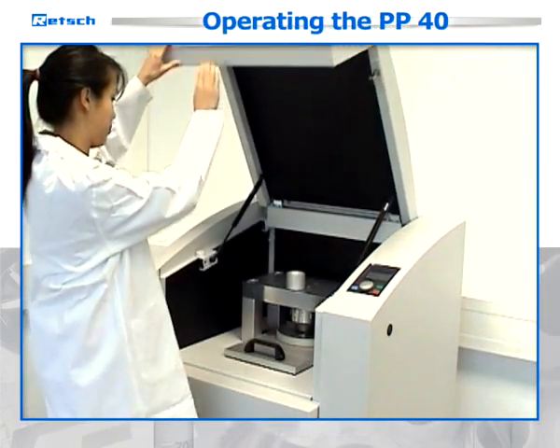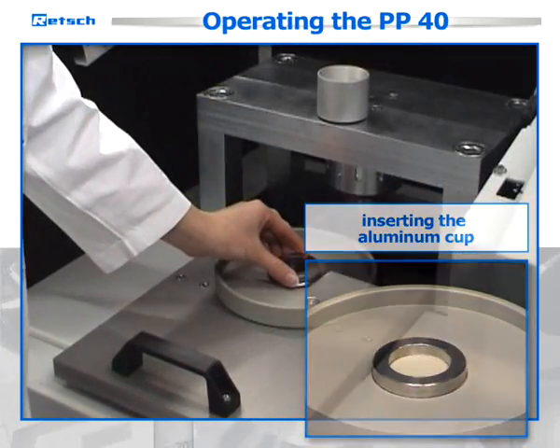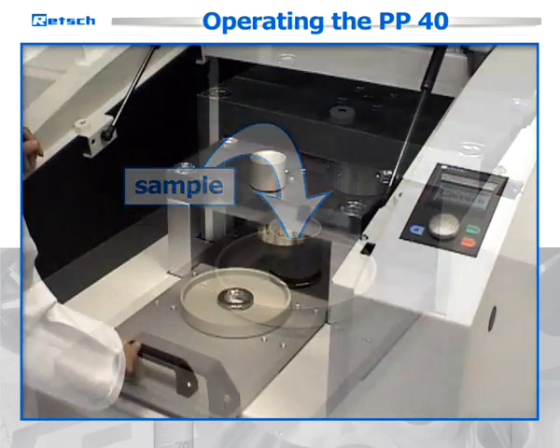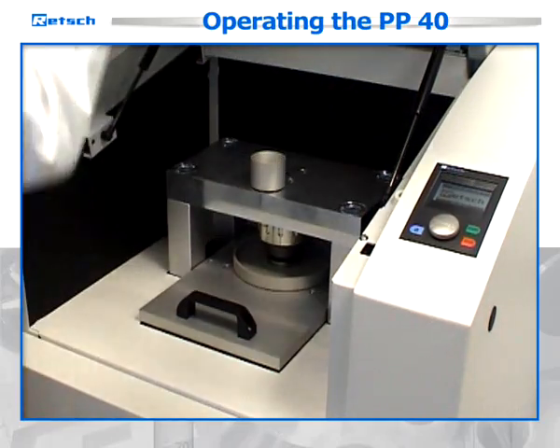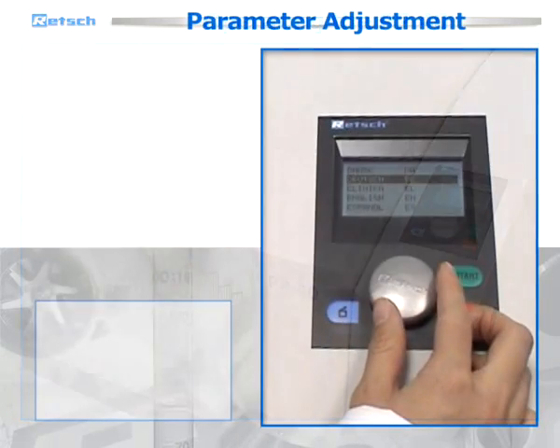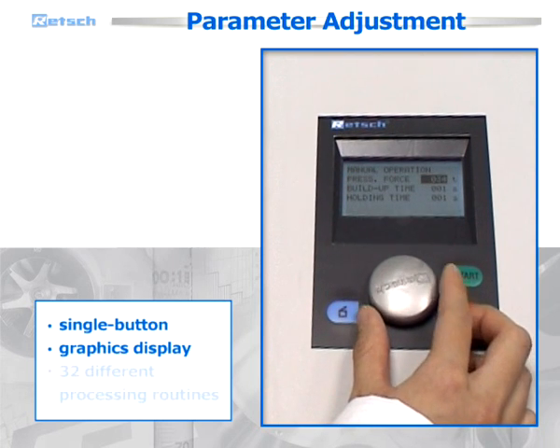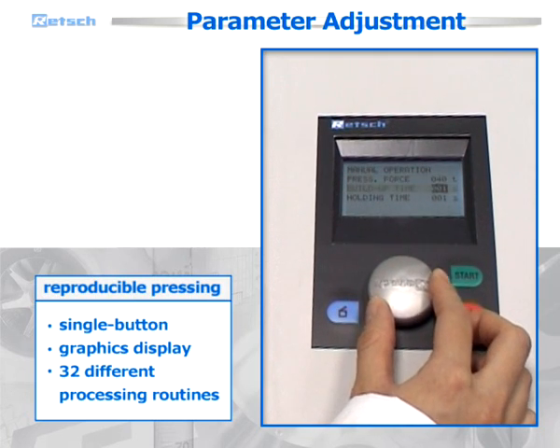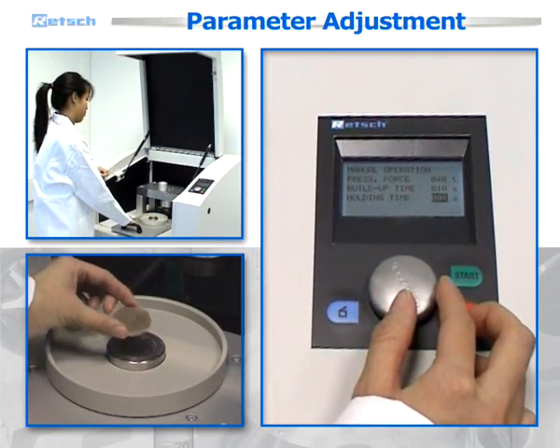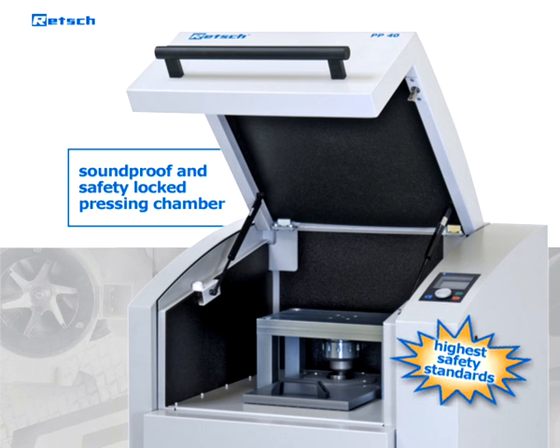Operating the PP40 is exceptionally easy. The pressing tool is mounted on a sliding tray which can be assembled simply and quickly. The steel ring or aluminum cup are put into the die and the sample is filled in through a filling aid. In the next step, the die is pushed beneath the pressure plate, the cover is closed, and after selecting the required parameter combination, the pressing procedure is started. Parameter adjustment is carried out by using a single button and a graphics display. The user can choose among 32 different processing routines which ensure reproducible pressing. When the pressing is finished, the cover unlocks automatically and the pellet can be extracted easily. With its soundproof and safety-locked pressing chamber, the PP40 meets and exceeds the highest safety standards.